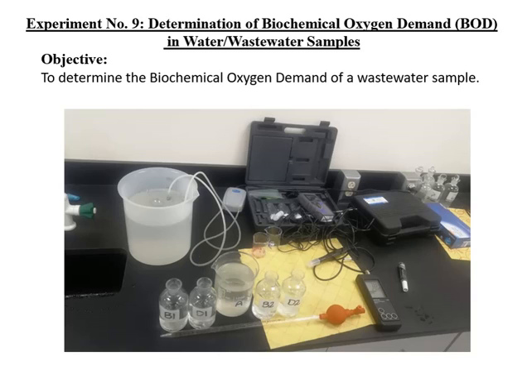Experiment number 9 is about the determination of the biochemical oxygen demand. This is also called the BOD. So, the objective of this experiment is to determine the biochemical oxygen demand of the wastewater sample.